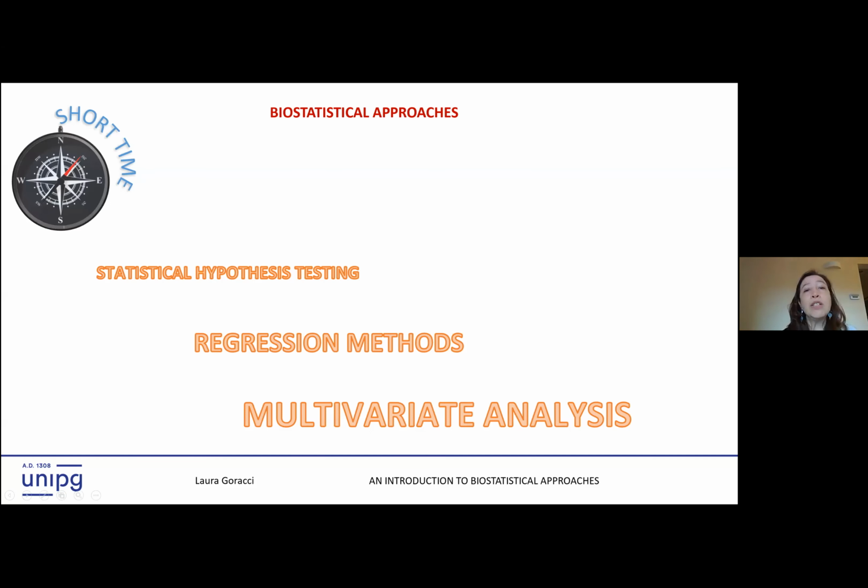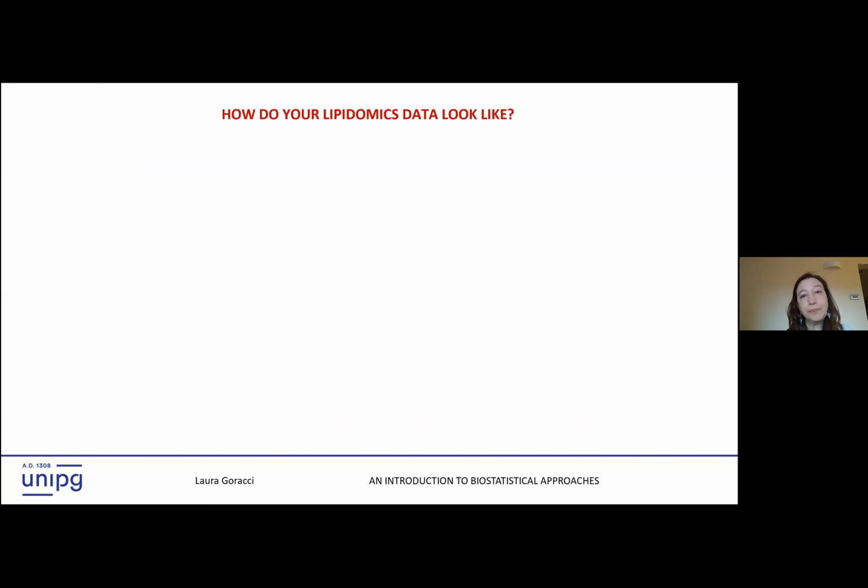Okay, so due to the short time, I will simply mention the statistical hypothesis testing that was explained yesterday, to go then to how regression methods work, and to focus the most part of this presentation on multivariate analysis.